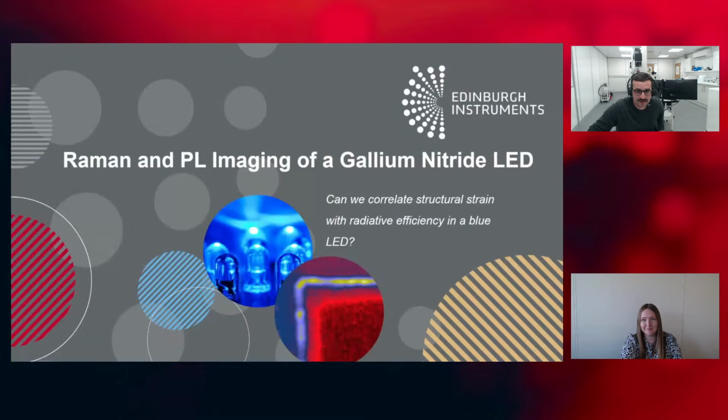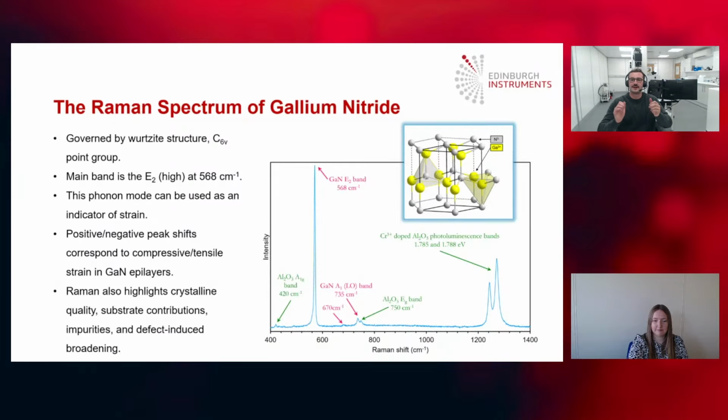We sure do, Angela. So for this case study, the question we set out to ask was, can we correlate structural strain with radiative efficiency in a blue LED? There are different challenges to analysing gallium nitride than there are to silicon carbide or silicon, which will become clearer in a second. So first, the Raman spectrum.